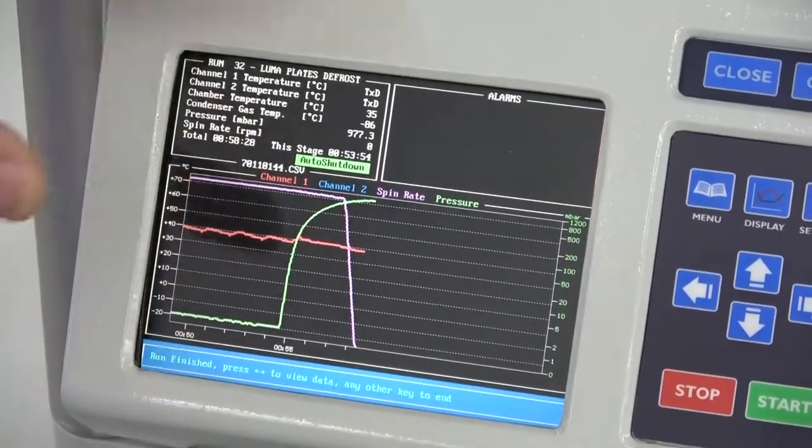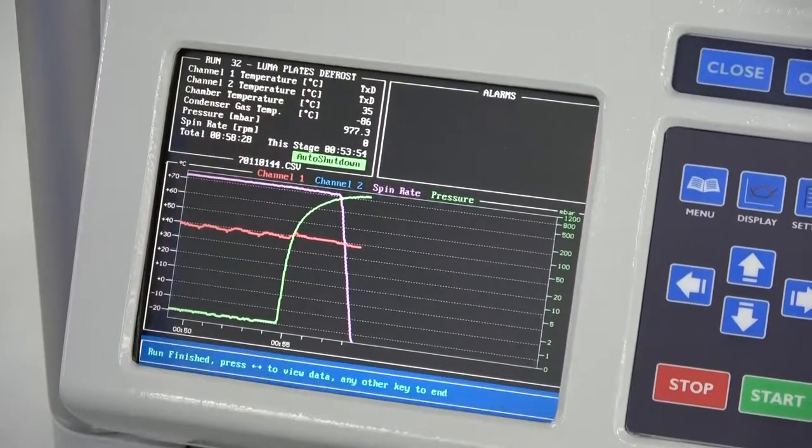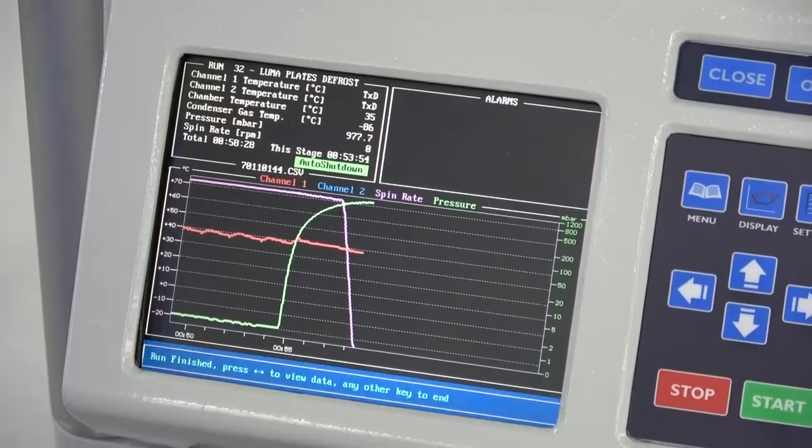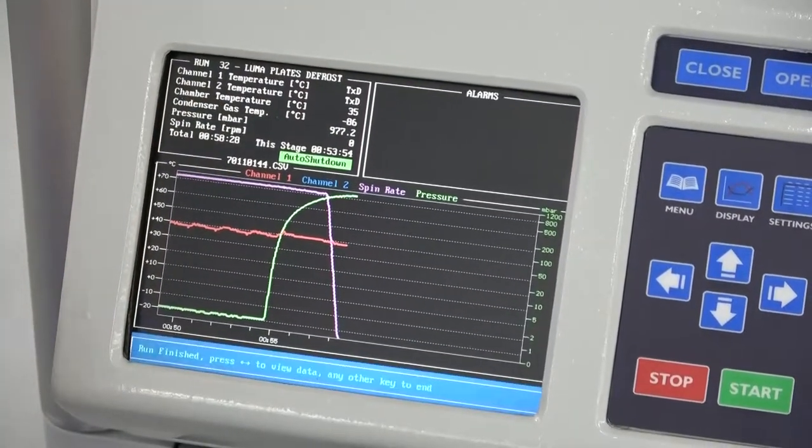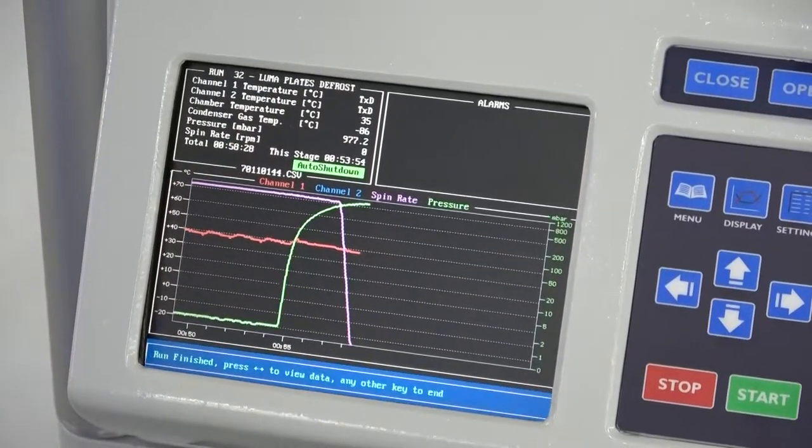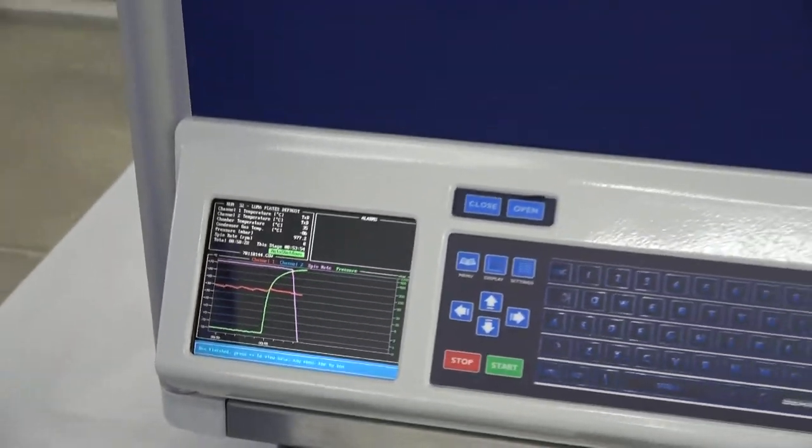So just a real nice crisp, clear chart there is really nice to look at. But you can see the vacuum is now released. And spinning is at zero in RPM. So the door is actually ready to open. We're going to take a look at the inside now.